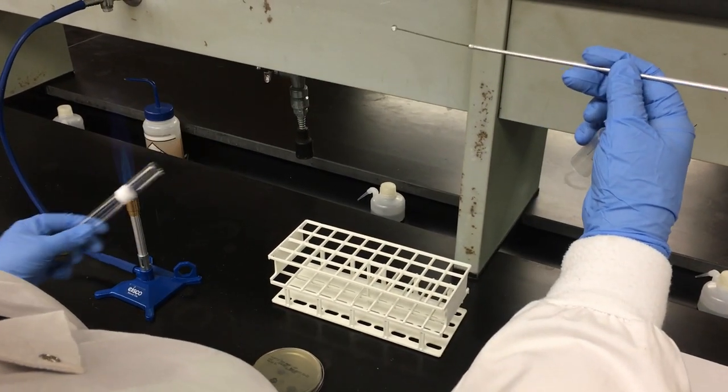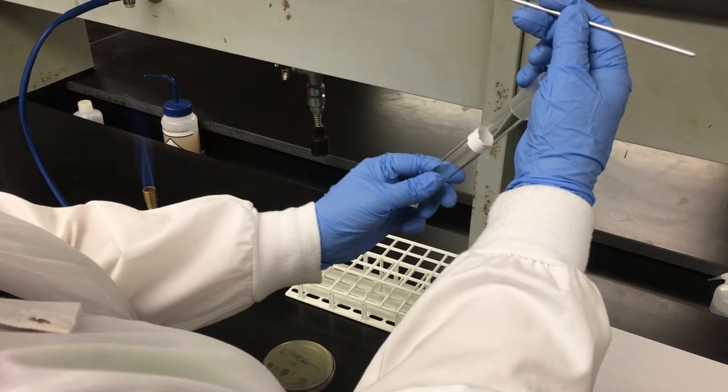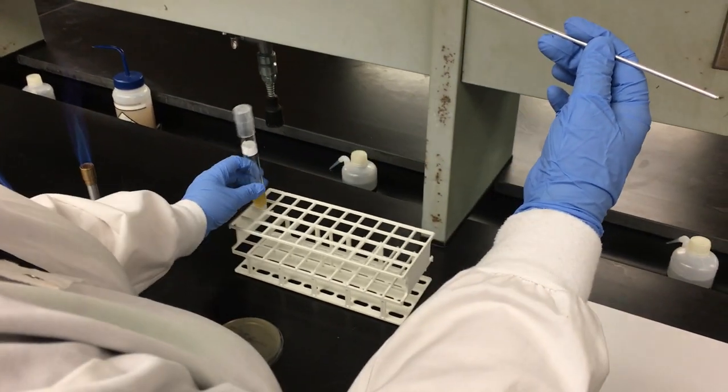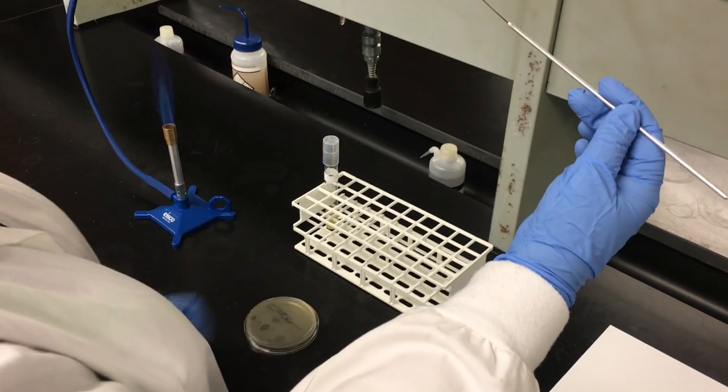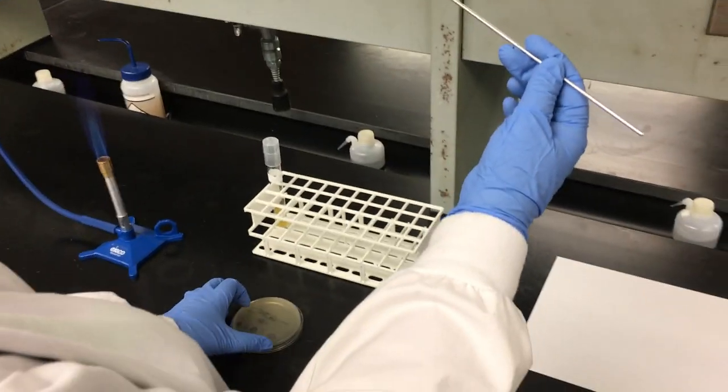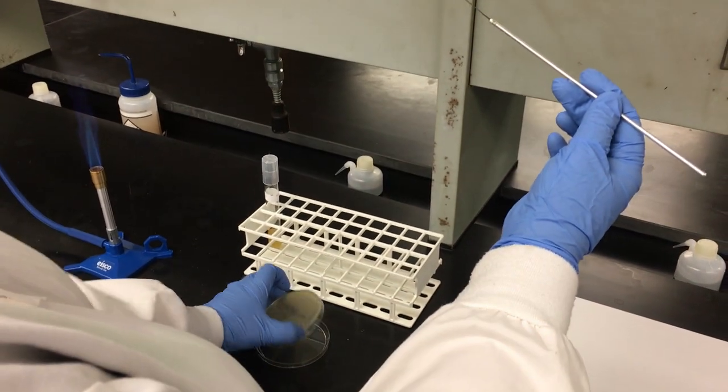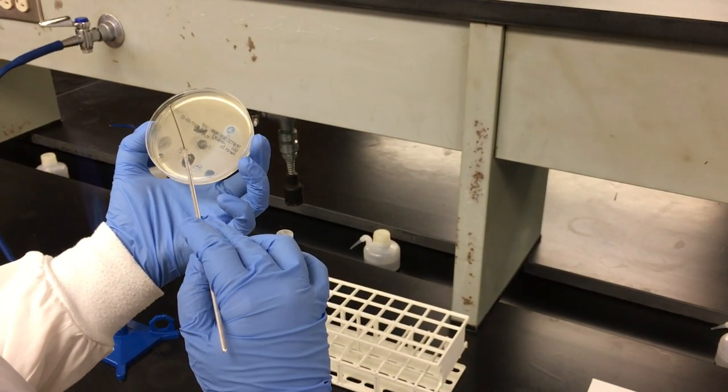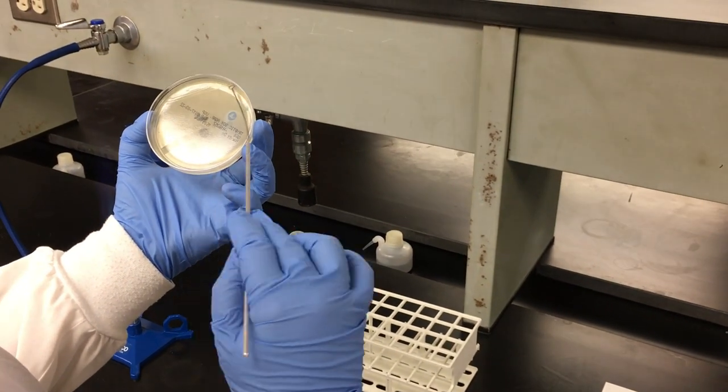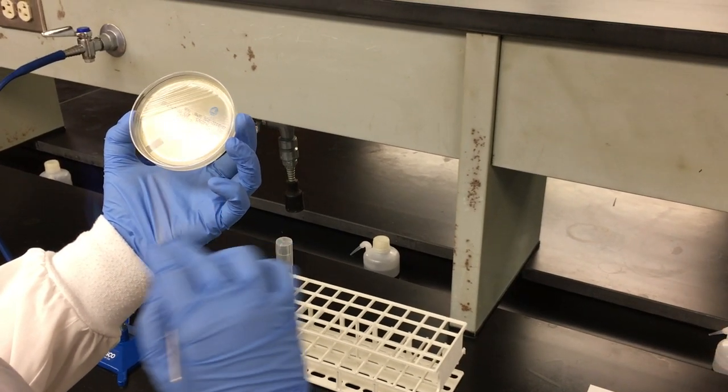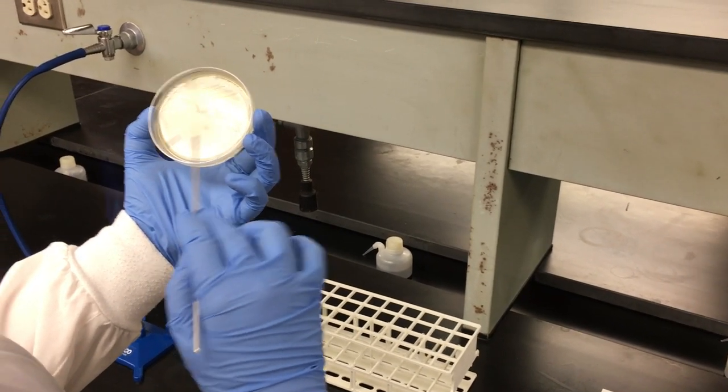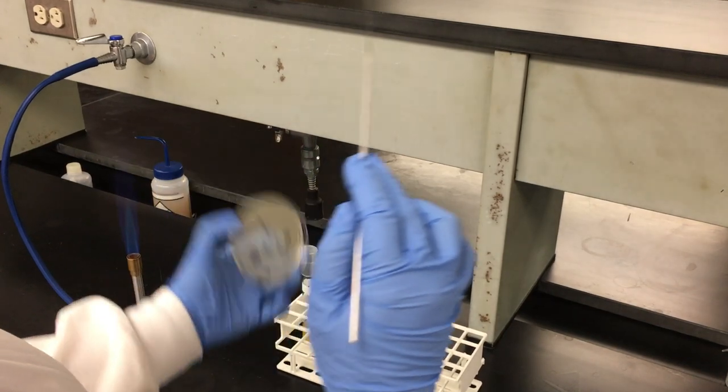Remove it. Reflame. Recap and place back in my rack. I will then proceed to streak my plate using three different quadrants. My first quadrant will be done in a zigzag pattern back and forth very quickly in the first quarter of my plate just to make sure that I've got enough organism.